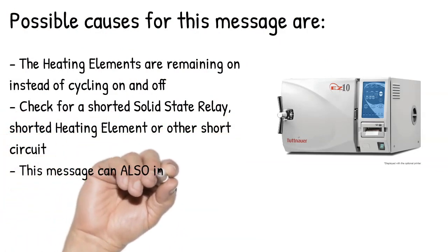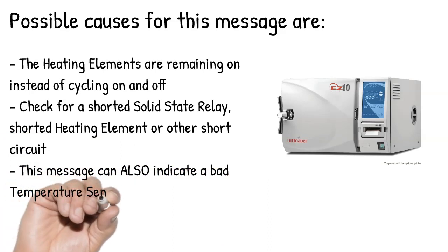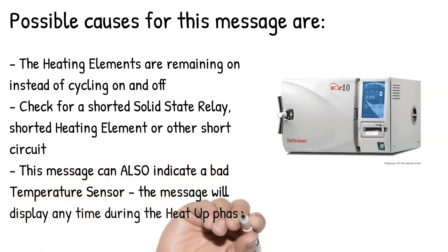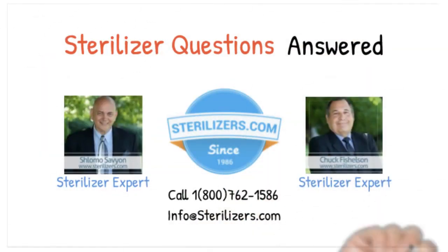This message can also indicate a bad temperature sensor; the message will display any time during the heat up phase. If you have any questions, give us a call at 1-800-762-1586 or email us at info@sterilizers.com. Thank you.